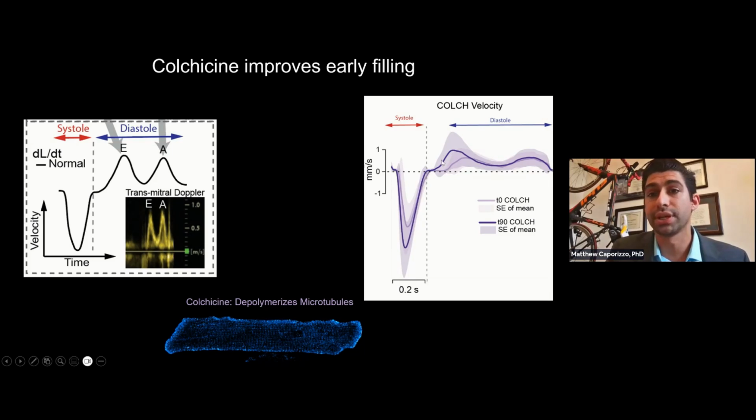And I hope what you can appreciate from these average traces is that this isovolumic relaxation phase is shorter. We more quickly get into the early phase of diastolic filling that happens more and at a higher peak. So we have an increase in the E peak shown here. And interestingly, there's really no change in the late filling peak, a bit of a nuance, but this is due to that rightward shift, we think, in the work loop.